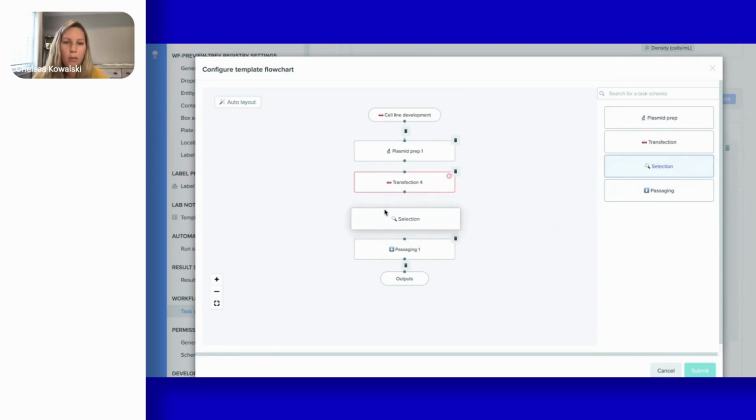And it's all built on top of all of the capabilities that you just saw. So it's ultimately going to allow for that next level of being able to support the design of your new science that you're working on.